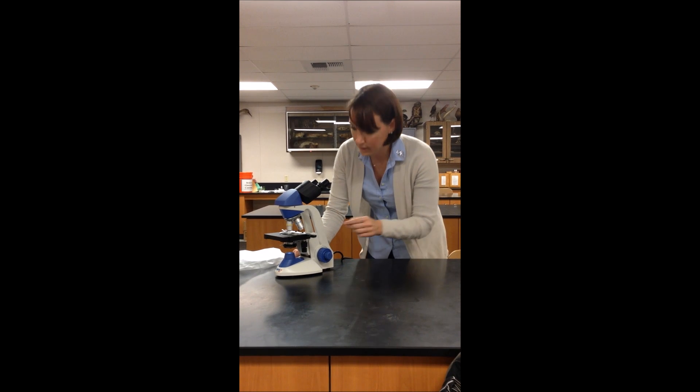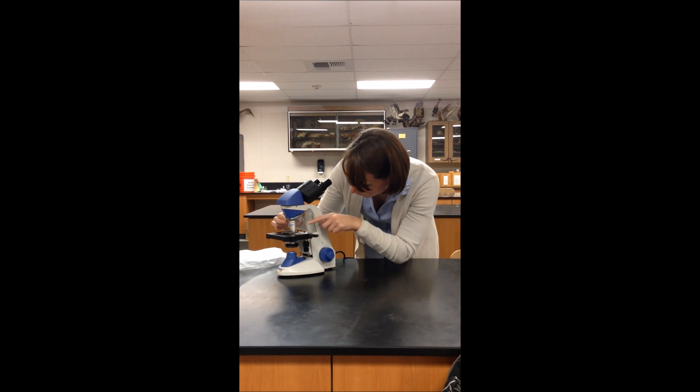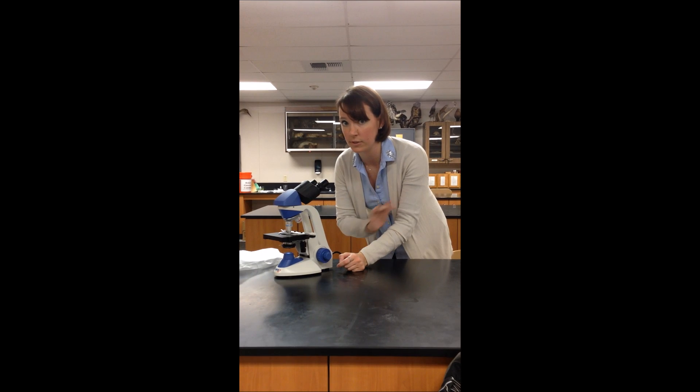And if I need to get any closer, I can move to the 40x objective, again watching and making sure that the slide and the objective do not make contact.